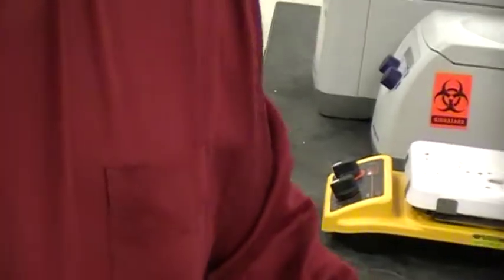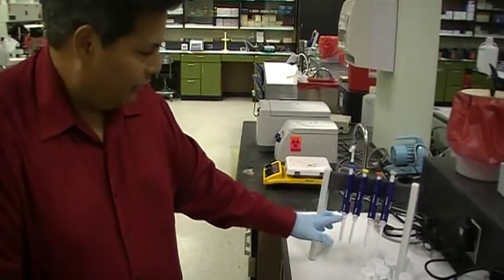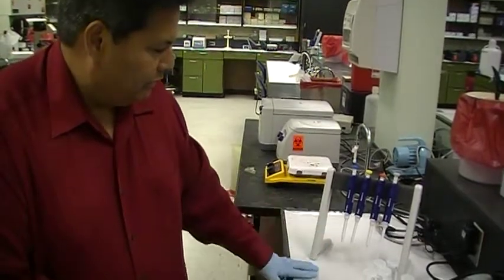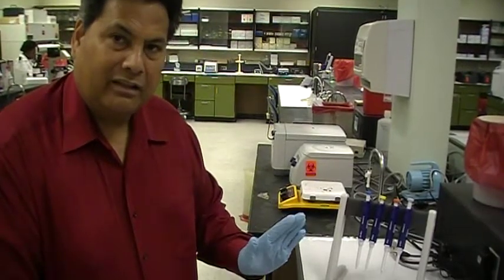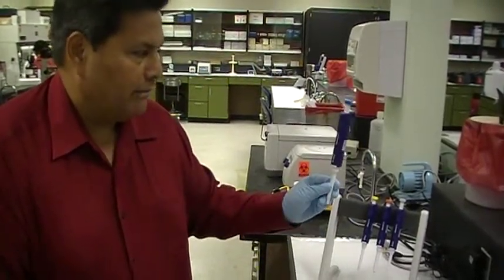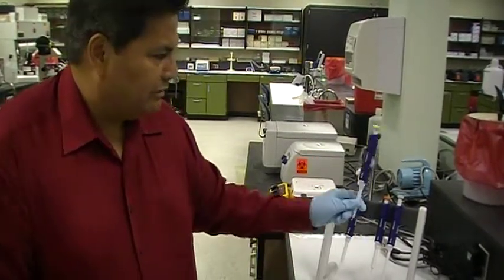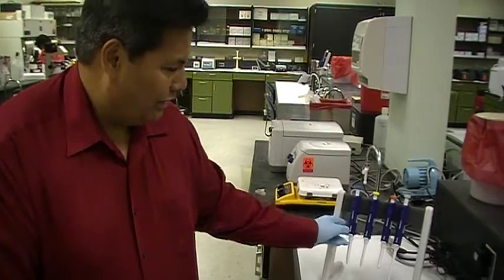So if you're going to pipette a certain volume — for instance, if you need to pipette 150 microliters — you're thinking in terms of yellow and blue. Yellow goes from 20 to 200, so it contains 150, and the blue goes from 100 to 1,000. The question is: how do you decide which one to use since both pipettes contain the volume? You use the smaller pipette that contains that volume. It's more accurate to pipette 150 microliters using the smaller of the two.